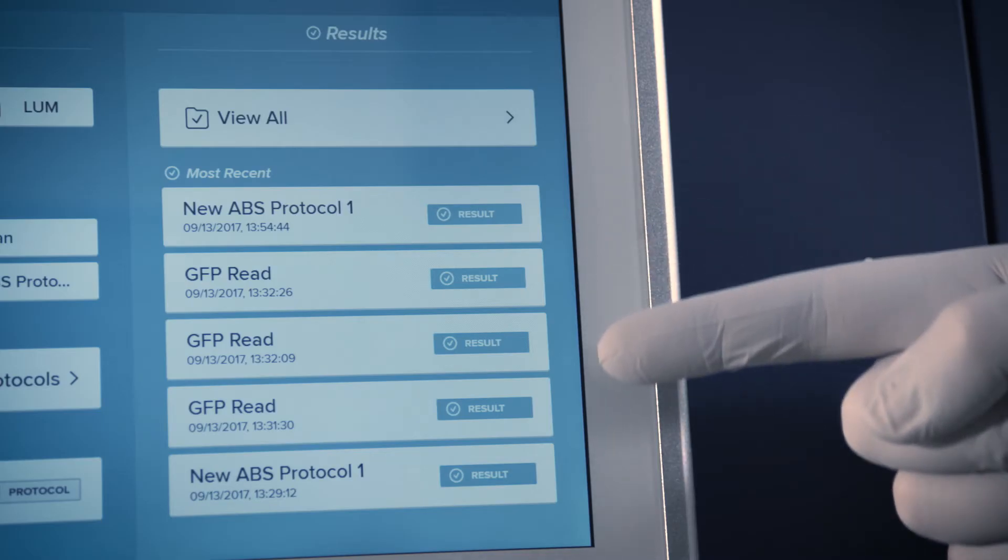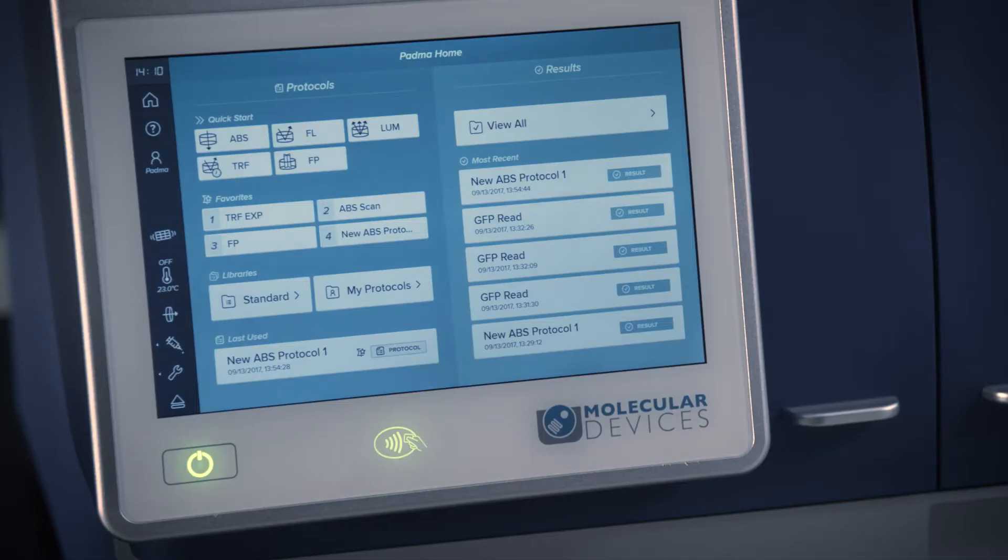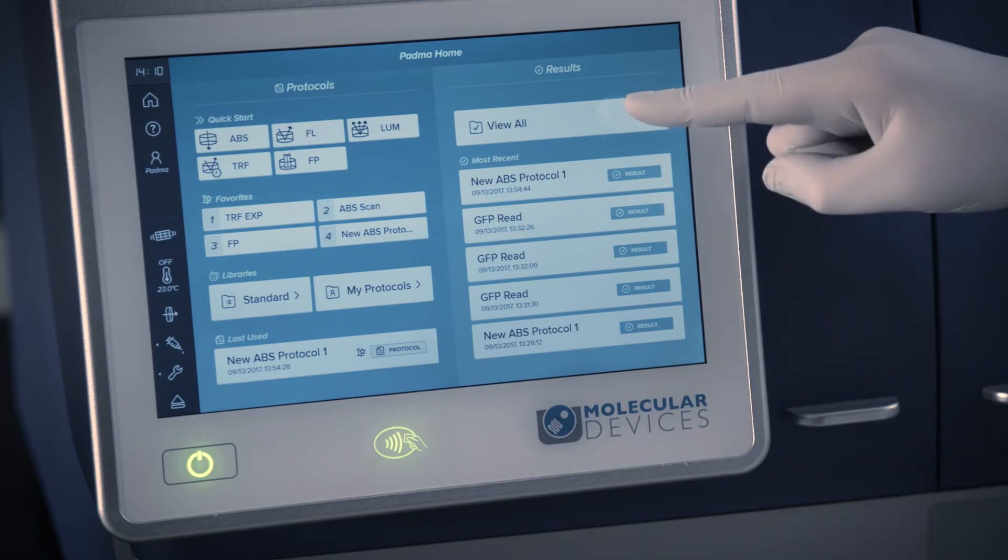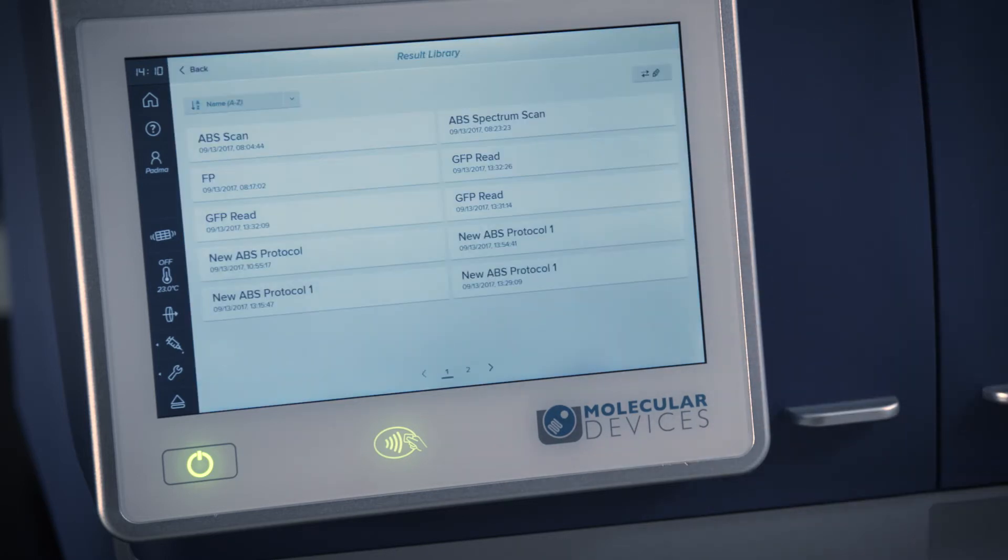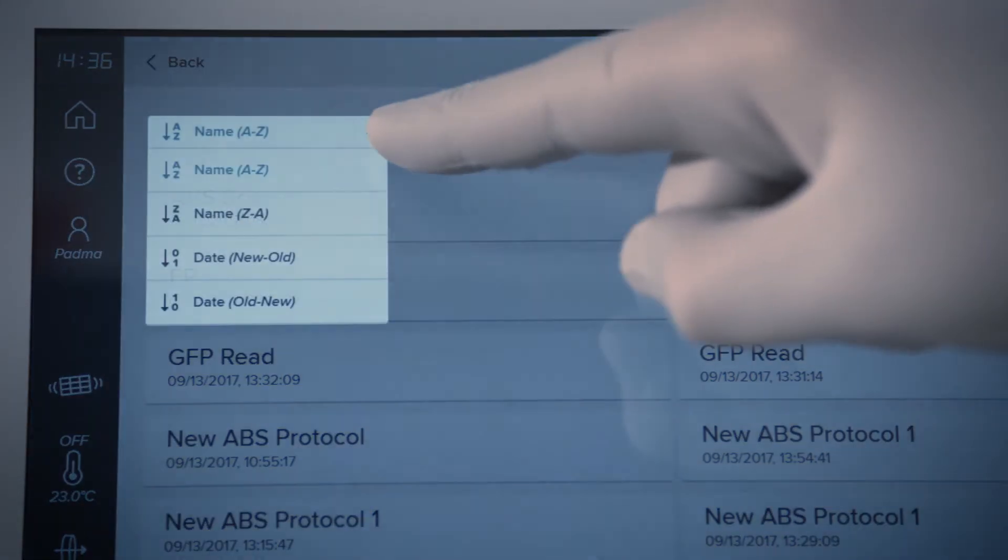Recent results files can be easily found on your homepage in the most recent results list. The remaining results files can be found in the results library, which you can access from the homepage by touching the View Results button. Easily find your results by arranging them in alphabetical order or in date order.